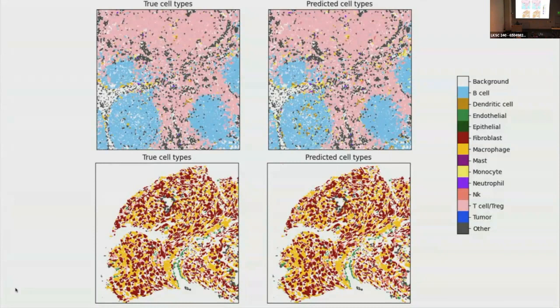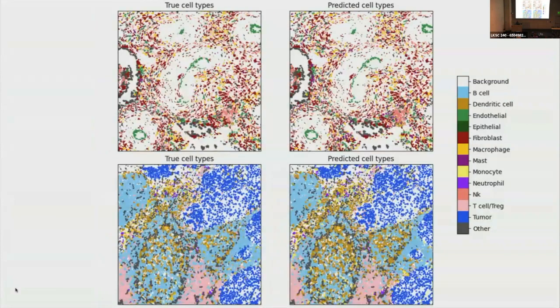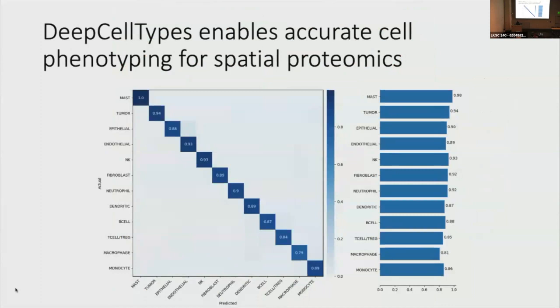And so compromise had to be made. But the accuracy is still quite good. And so the combination of the cell phenotyping positive markers plus a harmonized, albeit reduced, cell type panel, we think there's going to be an effective out-of-the-box solution for a lot of these problems. And not surprisingly, this works quite well when you actually do the rigorous benchmarking.